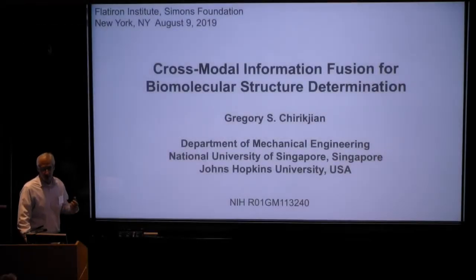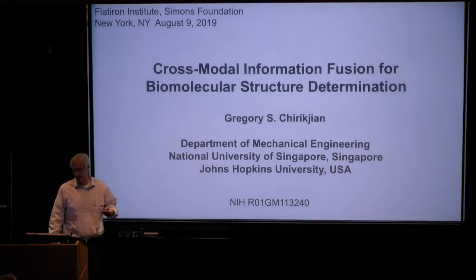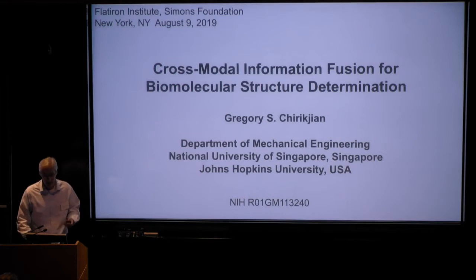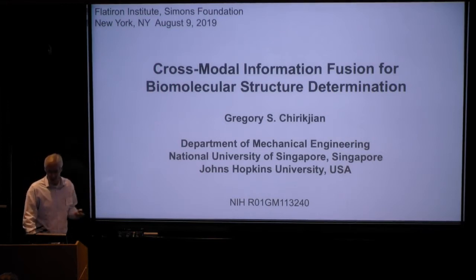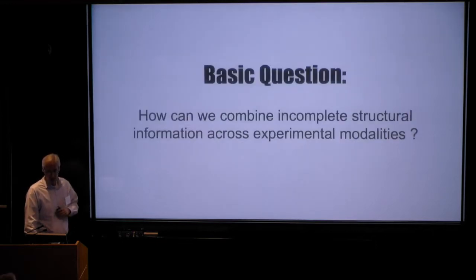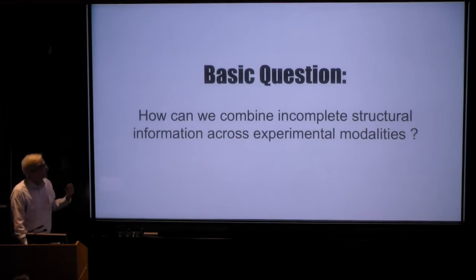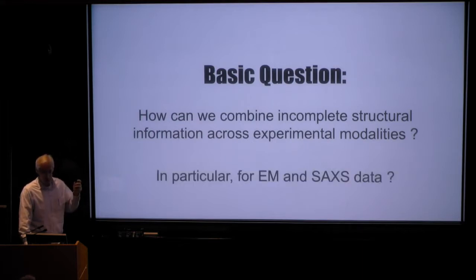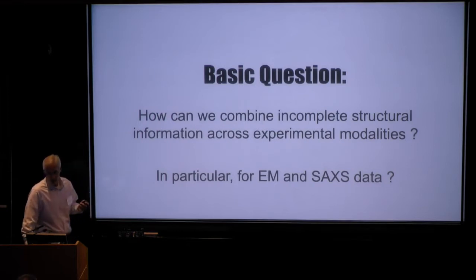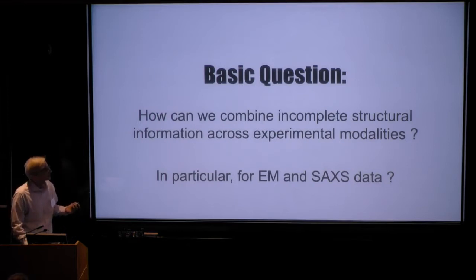So I'll be talking about cross-modal information fusion between SAXS and EM, okay? And I'll try to make the case as to why that's a reasonable thing to do given the resolution revolution that's taken place in EM. But more generally, I'm interested in combining information across different experimental modalities in structural biology. Specifically in this talk, between EM and small angle X-ray scattering, SAXS.